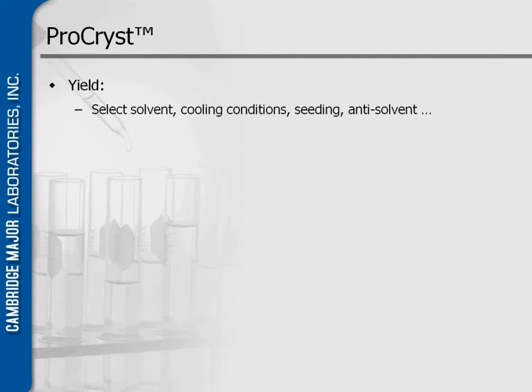Maybe you have to select a different solvent if your nucleation curve is very flat and you cannot get a lot of material out of your solvent by just cooling down. Your cooling conditions can be very important. How far to cool down, but also how fast.